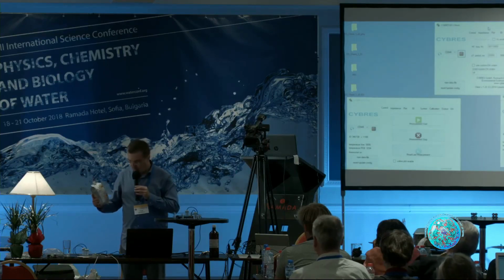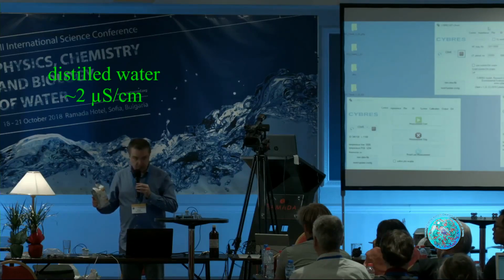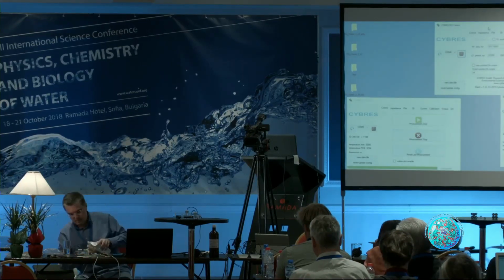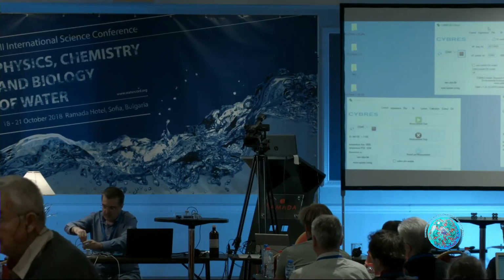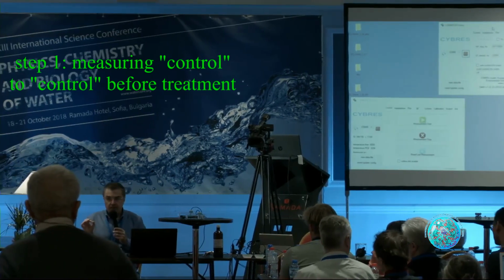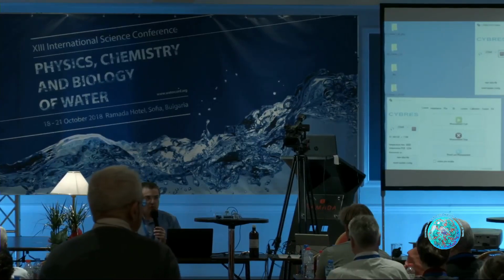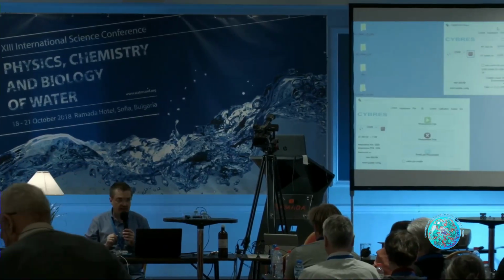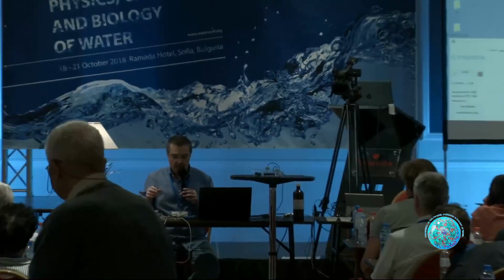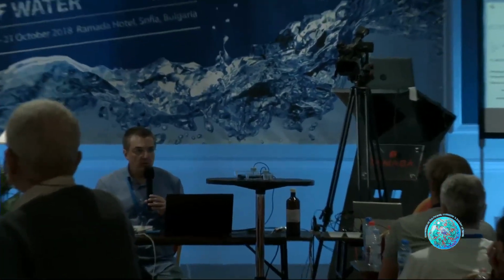Pure water. So what I'm doing, I will fill both containers with pure water. Okay, done. Just a comment, the whole electrochemistry is sensitive. It's not super sensitive to temperature, but it's sensitive to temperature. And also it's sensitive to, for instance, when I touch it with my hands, then it's well visible in the measurement. So handling it requires a little bit of understanding that during measurement you can basically change your samples.